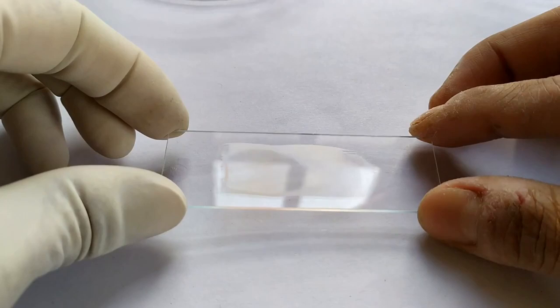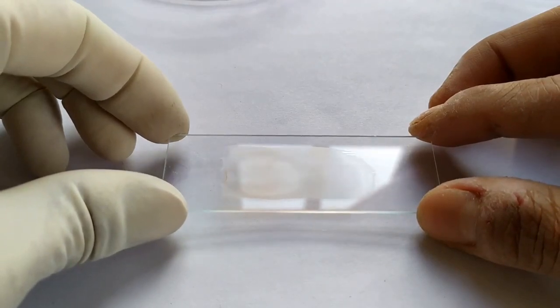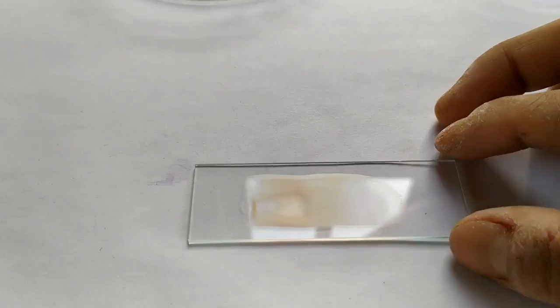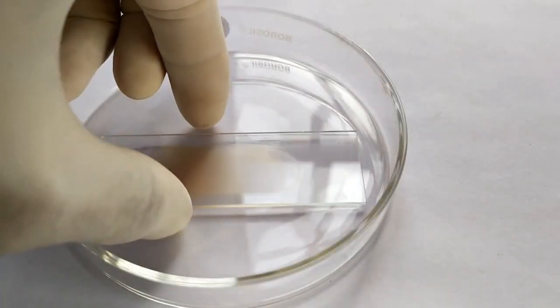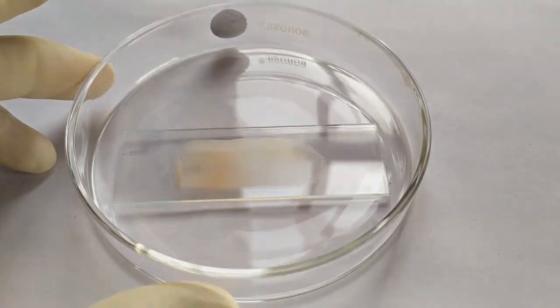A properly smeared blood appears roughly tongue-shaped. Allow the smear to air dry for a minute or so. Place the slide in a petri dish with the blood smear facing up.